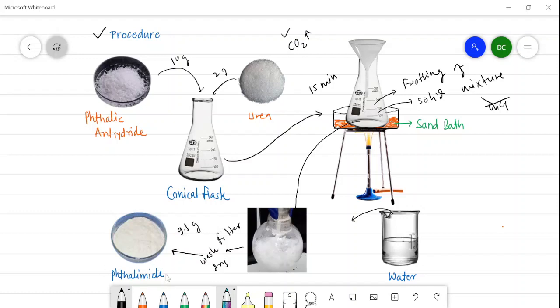Now this crude product, it is nothing but phthalimide, but it is then recrystallized from ethanol, and after recrystallization the pure product which is obtained is subjected to melting point. Now we can measure the melting point of this recrystallized product and it is found to be 238 degrees Celsius. So in this way we can obtain crude product as well as recrystallized product and the melting point of this product.